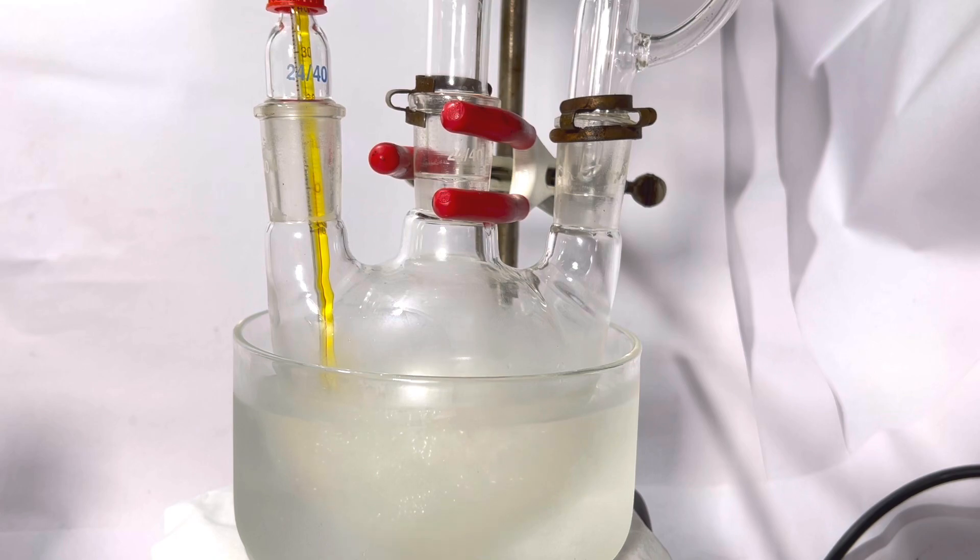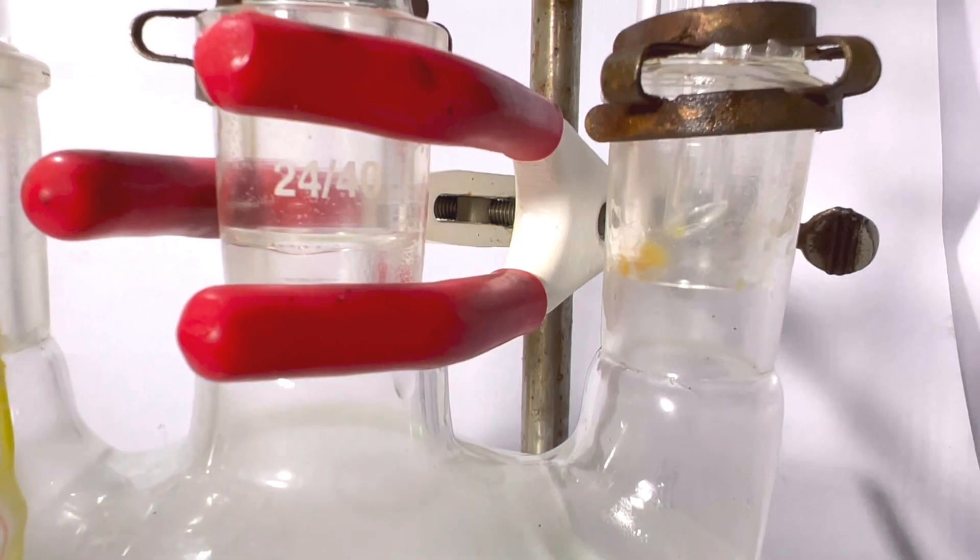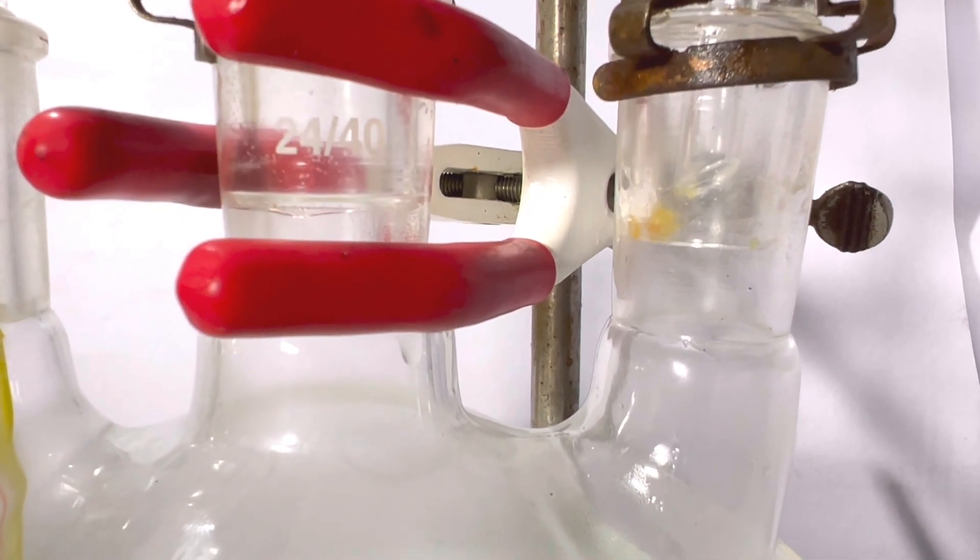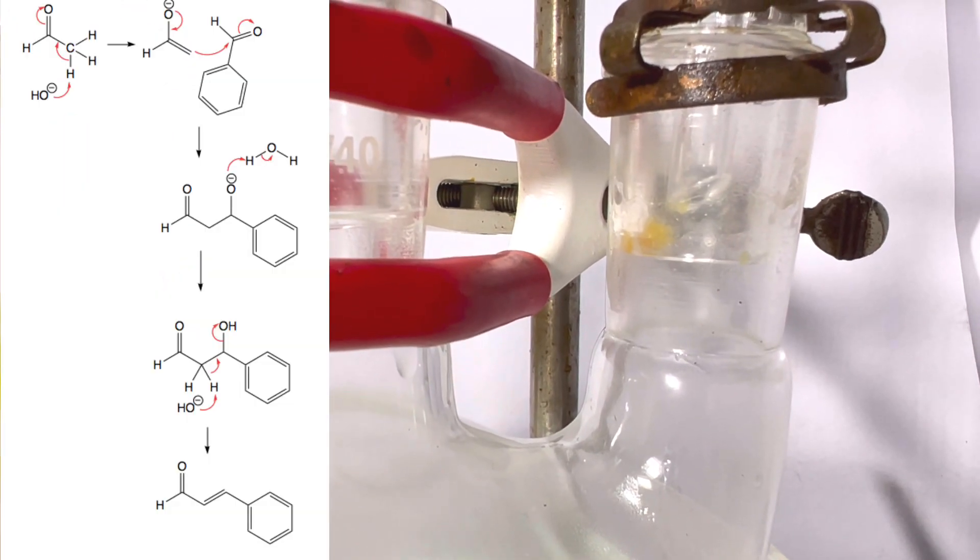Soon you will start to notice dark brown to orange color stuck inside the walls of the glassware. This is the cinnamaldehyde being formed. While the potassium hydroxide is dripping slowly, let's look into the reaction.